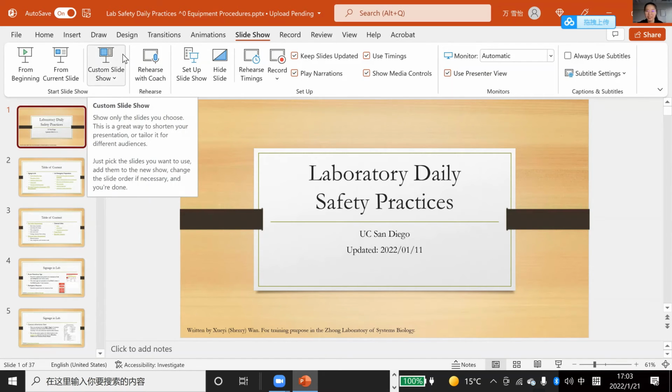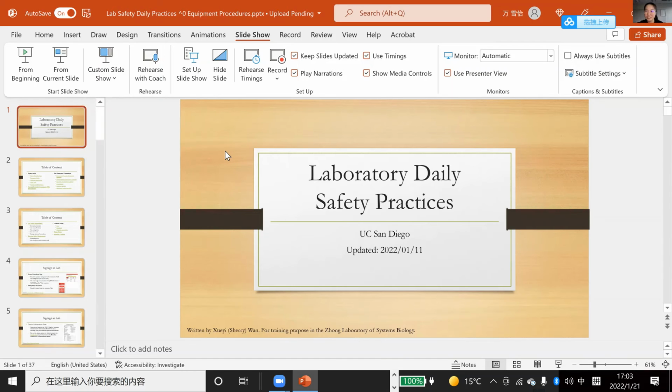Yeah, thanks, Tianyang. Closing the pipette tip containers is a huge finding in our lab audit. I know it is a little bit inconvenient to close it every time, but at least make sure you do that before the audit.